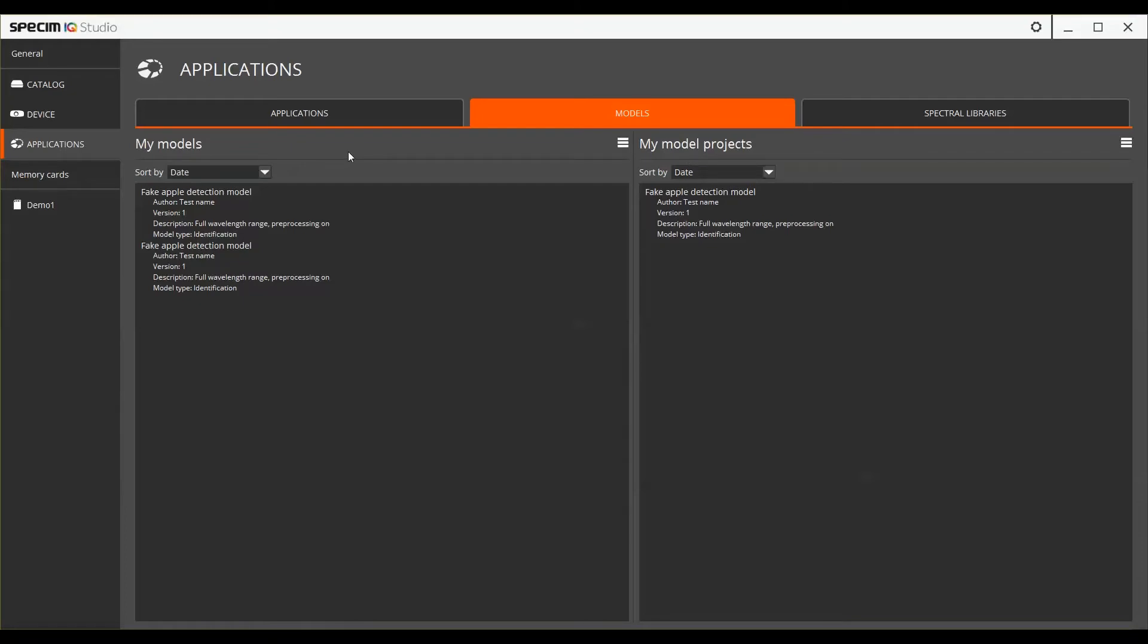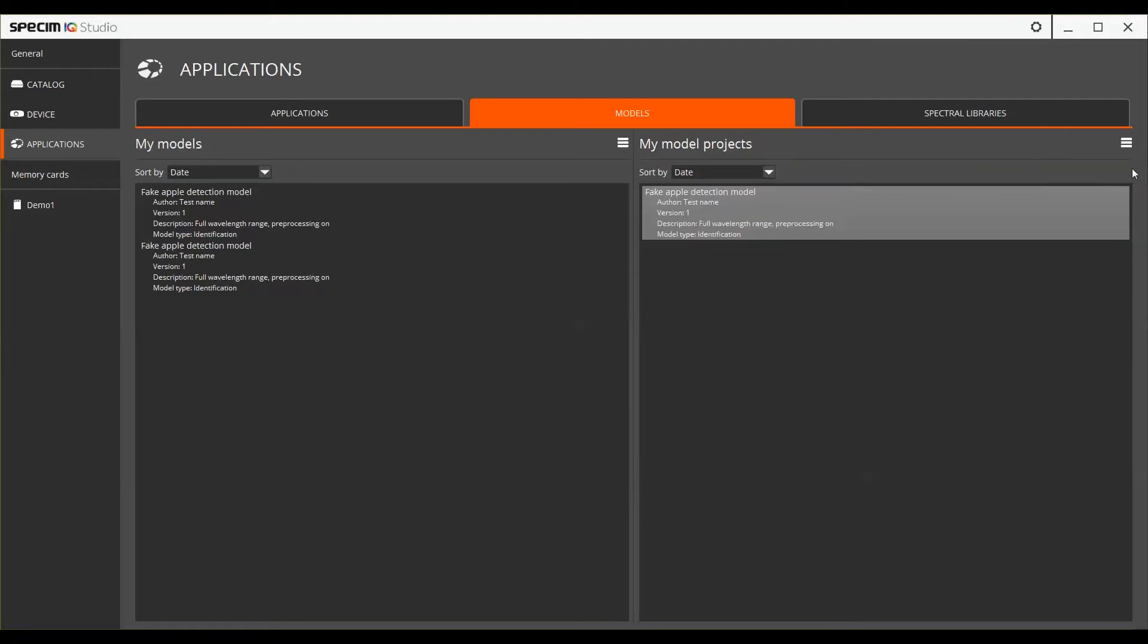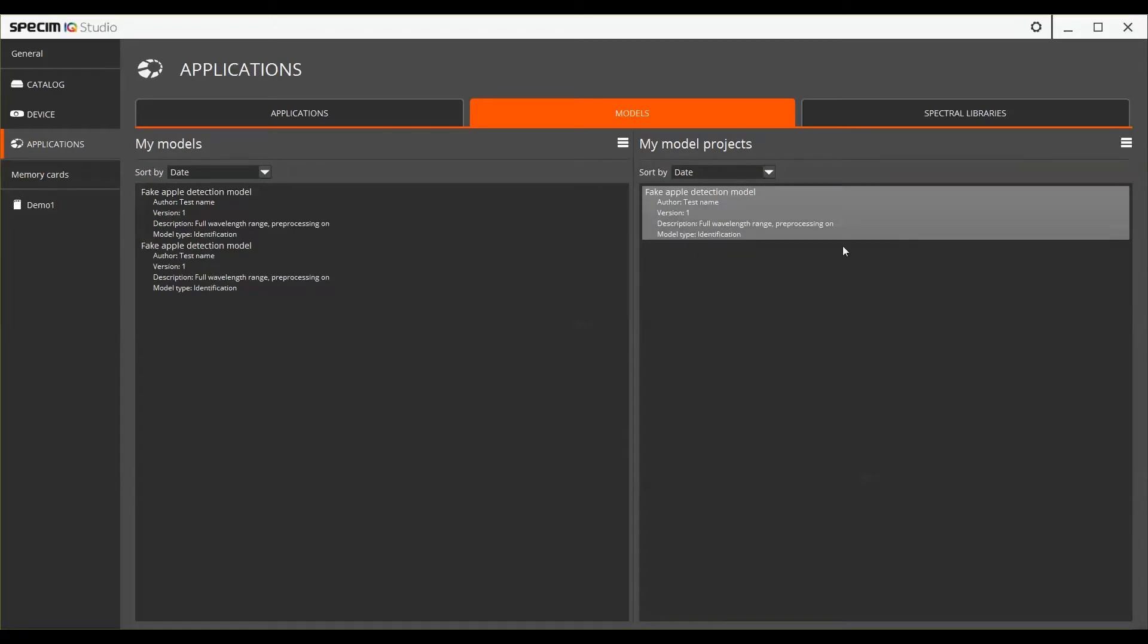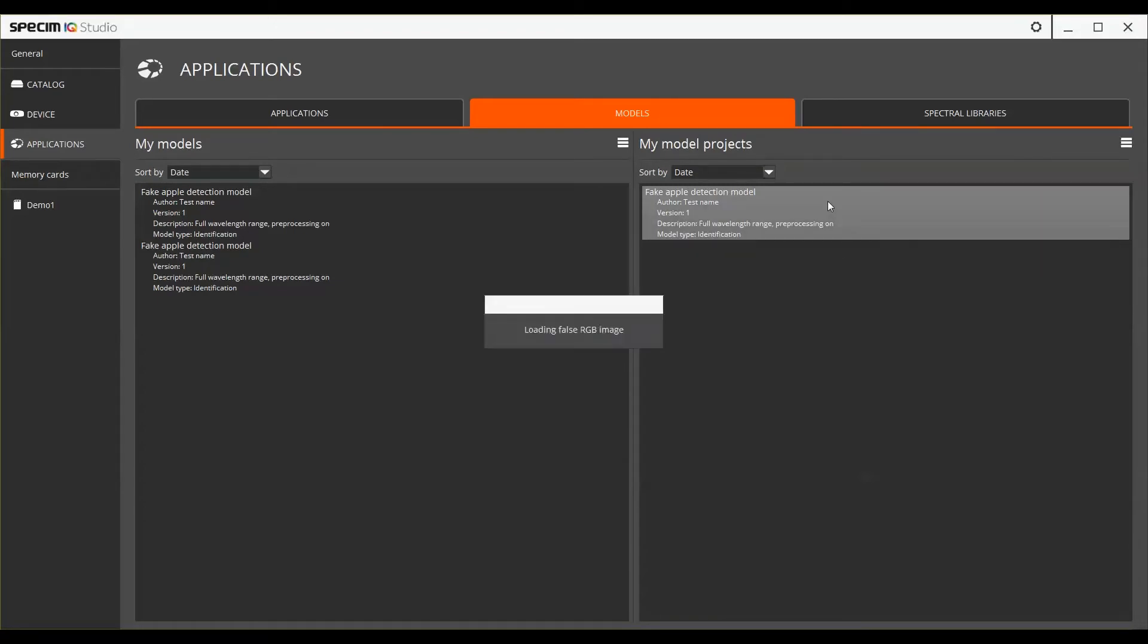You can create a new project by selecting it from the burger menu. To open an existing project, either select it from the burger menu or by double-clicking the projects.